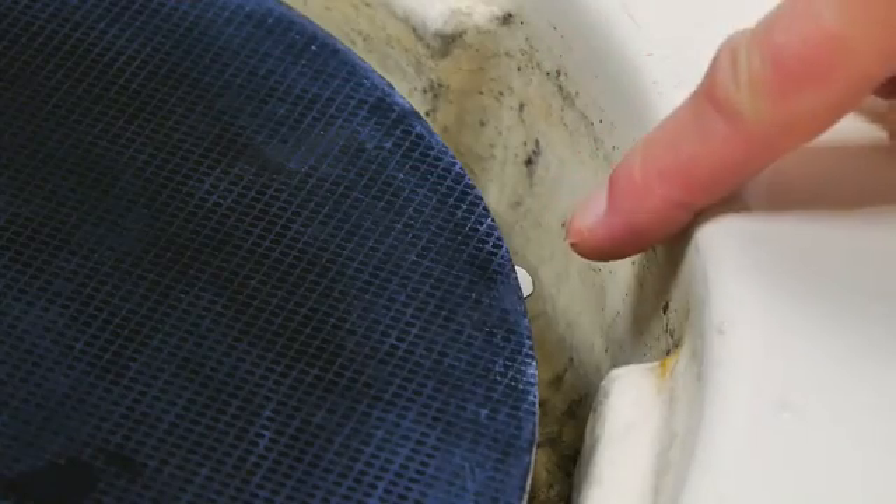As you can see, this machine has a magnetic base. Easy removal of the disc is facilitated by the tabs on the disc themselves. Here is an example of a polished printed circuit board using this route.